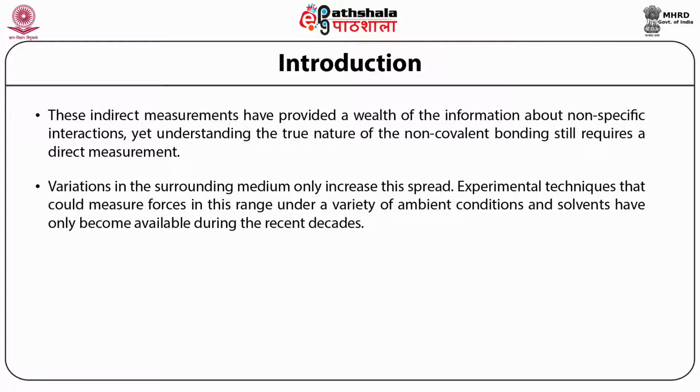Specifically, three techniques are capable of such measurements. These are surface force apparatus, optical and magnetic tweezers, and atomic force microscopy. Of the three techniques, only AFM possesses both the sub-nanometer spatial resolution and piconewton force resolution necessary for characterizing the strength and spatial distribution of intermolecular interactions.